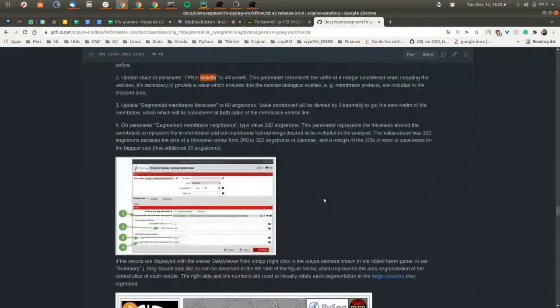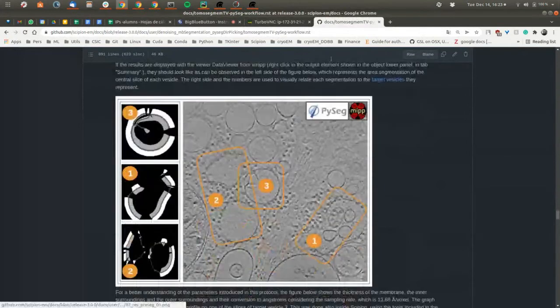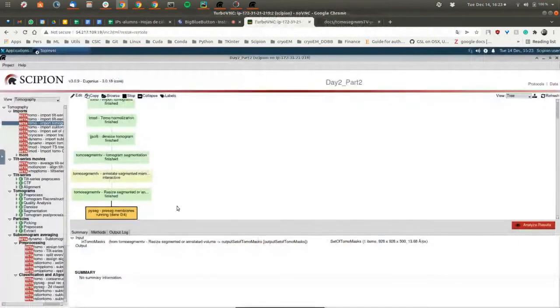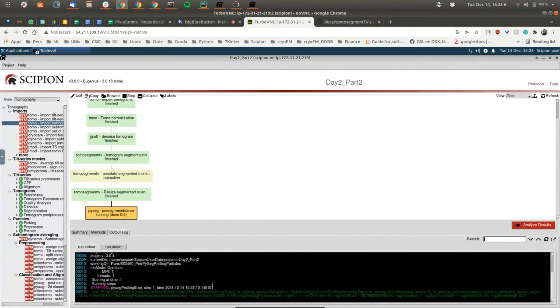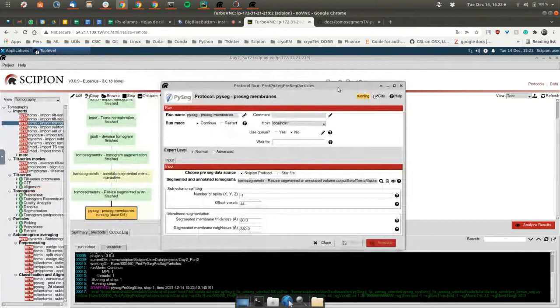And it was a small spoiler. It should be quite fast. I think on my machine it was about... I failed, probably because I loaded the wrong file, because I'm one of those who had to copy. Yeah, okay, it's okay. In your pointer, you have to copy.